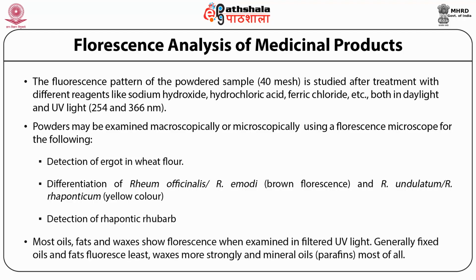With respect to oils, fats and waxes, generally speaking, fixed oils and fats fluoresce least, waxes more strongly, whereas mineral oils are the most strongly fluorescing substances.